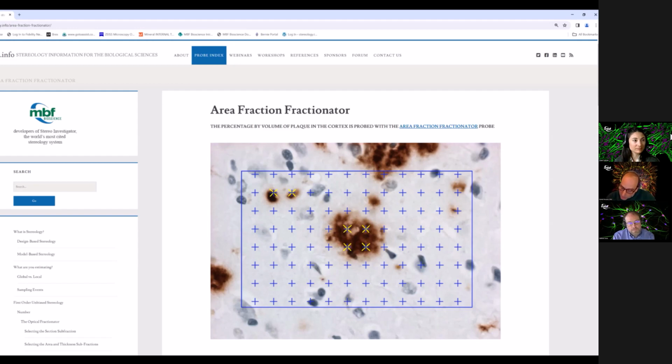They're not sure whether that little black dot they see is a whole cell or a half of one or a third of one. And so by figuring out empirically, what I mean is put it up on the microscope and focus through the cell and make sure you have many focal planes through the cell, and you can actually focus on just the cell top.